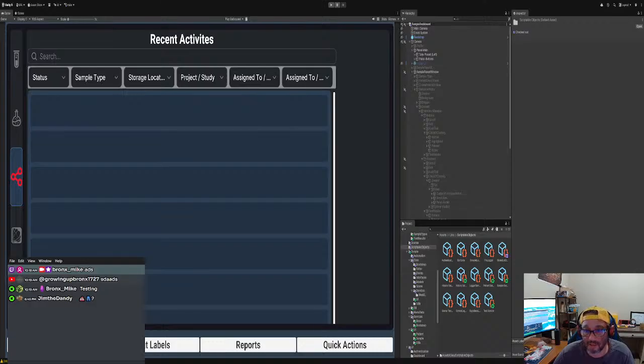Now we're going to create a test order if we want to, and then we also are going to get a test order if we want to, and then we also are going to have pending orders, which we're going to need. Upgrade, yeah, whatever. And then we're going to start test performance. We're not going to test yet. And then we're going to search the test, and then we're going to get the results by the sample ID.